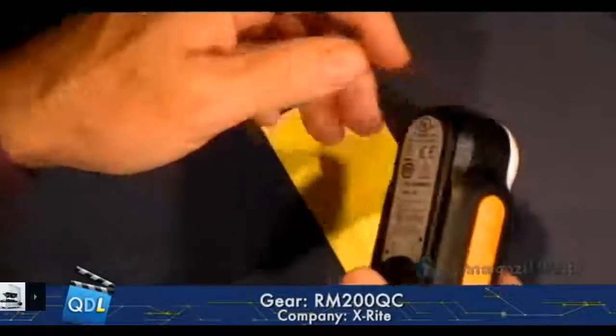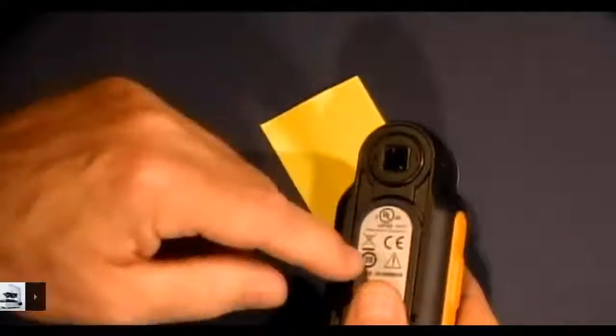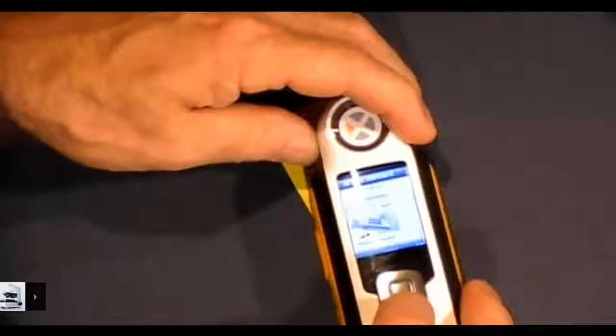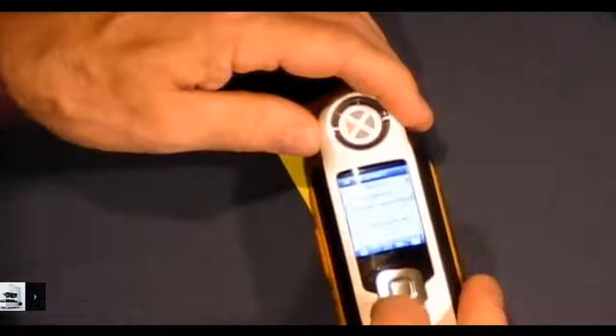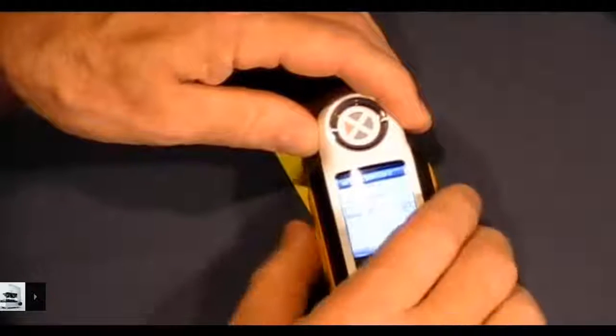Oh, and it reminded me, sorry, I was reading that. It told me that I didn't have my optics. I was still in calibration mode and my lid was still closed. So let's start from scratch then. Sorry about that. That's what little warning messages are all about. So we'll go back into edit mode. Nice little functionality there. Okay, we're ready to go.